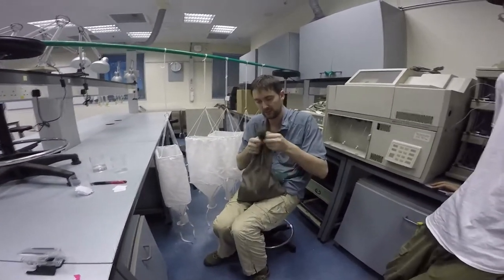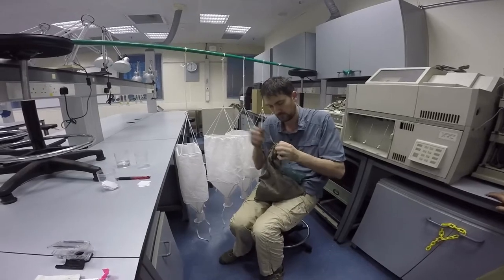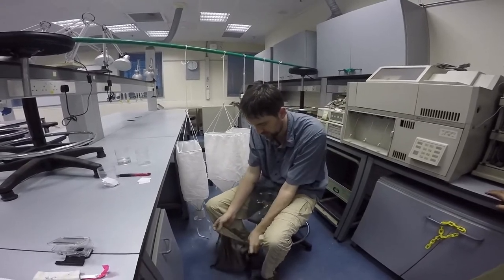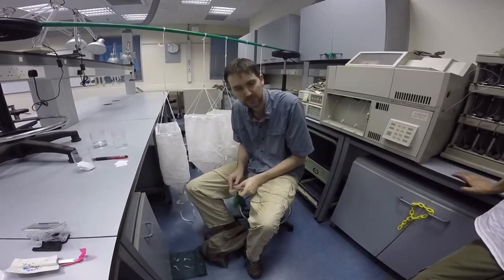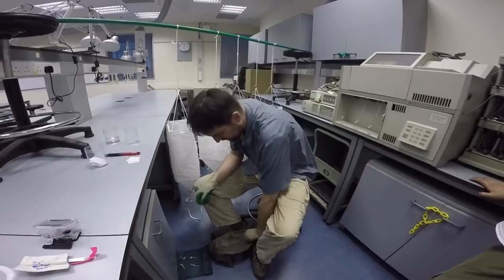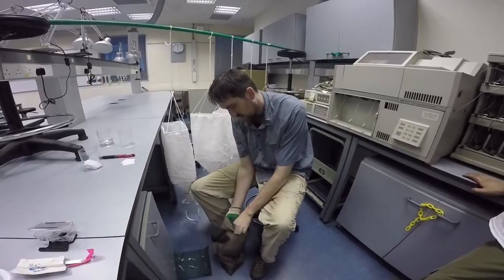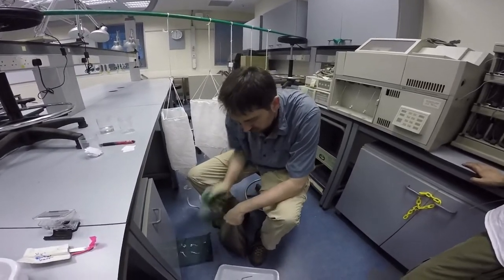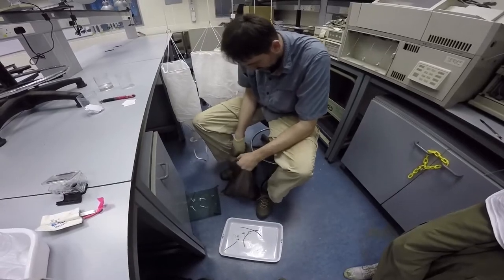So I'm going to take this bag here, try to open the knot — there we go. I'm just going to shake it a bit so everything falls to the bottom. What I'm going to do first is to remove some of the longer twigs that could get kind of stuck into the mesh bag and then prevent the leaf litter from being widespread.